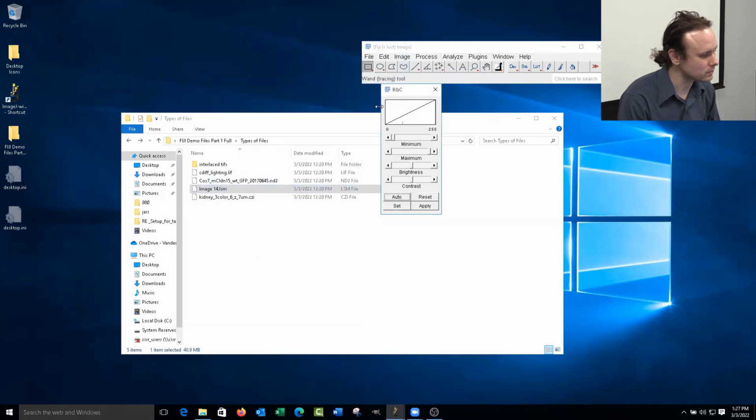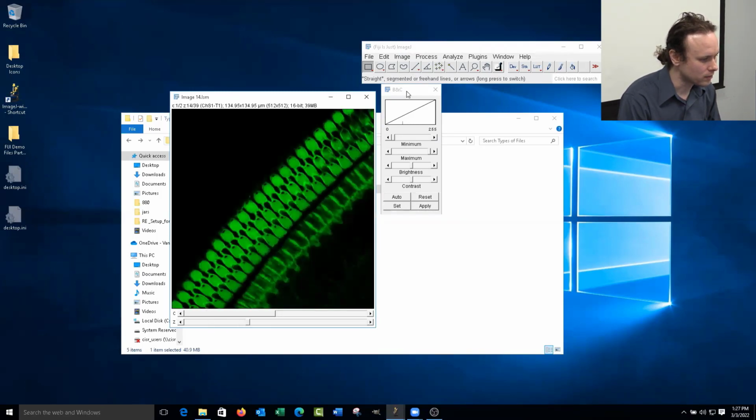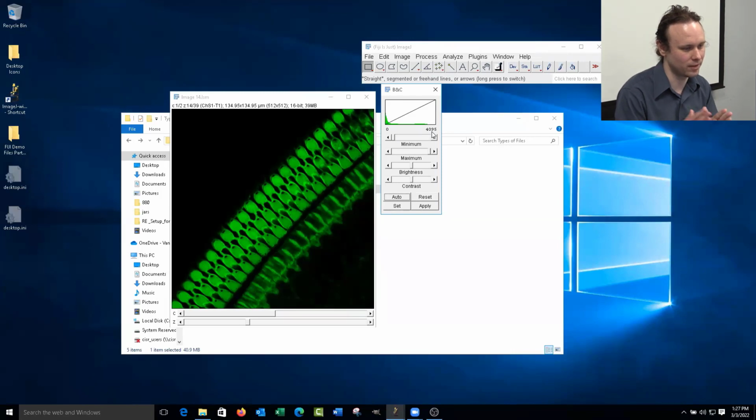All right, so if we look at this, we have, in this case, 4,095 channels of brightness. So that's different bins that we're looking at, all these different levels that we can see here. If we immediately converted this down, we would have to average a lot of these channels together to get down to that 255 number. And because we're averaging channels together, we're losing information.